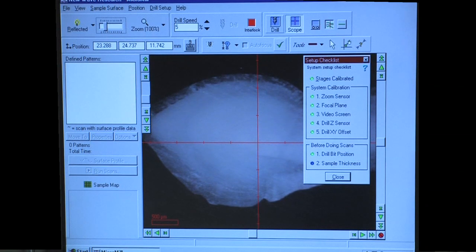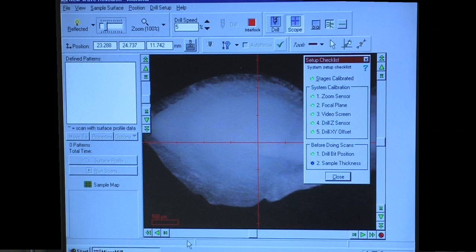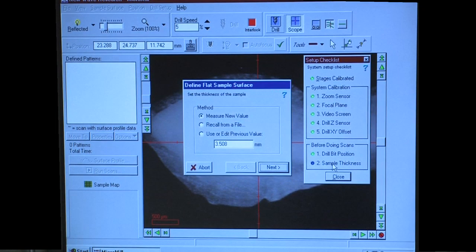To set your sample thickness, center your sample on the screen and choose the Sample Thickness button on the Setup Checklist window and follow the screen prompts carefully. At the first prompt, select Measure New Value and then click Next.